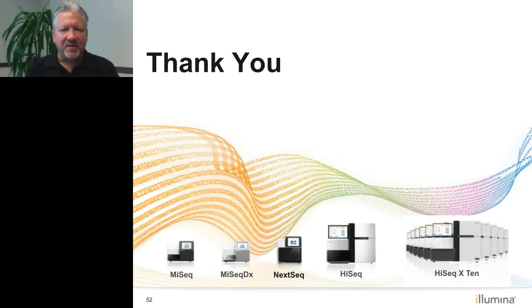There is a question about whether we can use this kit for looking at bacterial populations or mixed samples, eukaryotic and prokaryotic. You could. We don't have probes in there for the prokaryotic transcriptomes yet. That's something we're considering for the future, to have the ability to create custom sets.